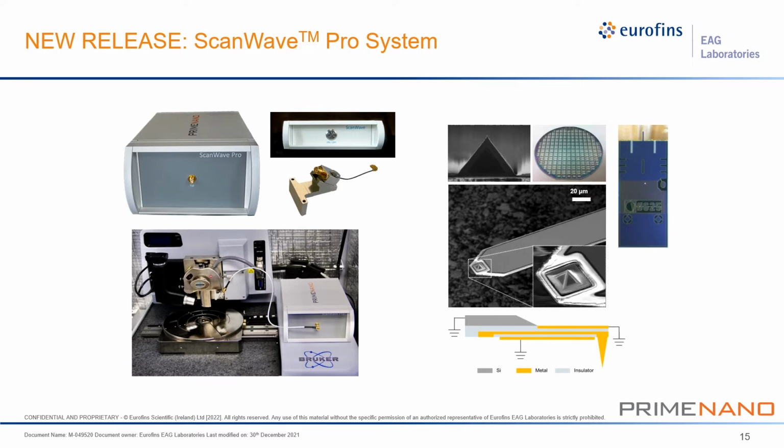Now, on the right, we have some scanning electron microscope images of the probes that are being used. You can see a very sharp apex of the tip. At the bottom, we have the schematic of the probe, which shows that the cantilever itself is completely shielded. Only the pyramid of the probe is exposed.